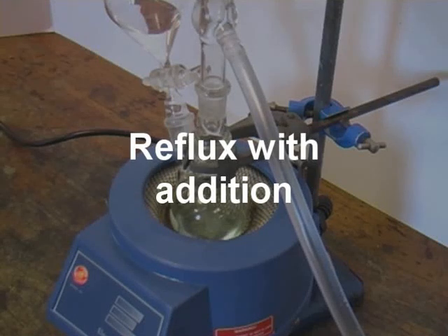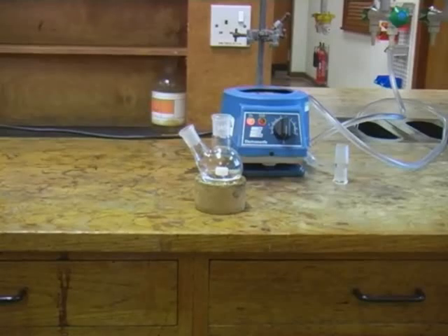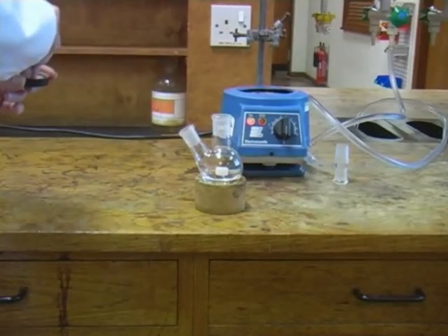Before carrying out a reflux with addition, we need to place our reagent solution into a round bottom flask with two necks. An alternative would be to use a one neck flask with a Kleisen adapter.